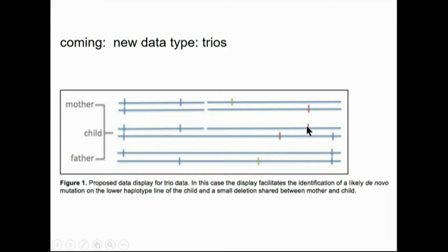But this variant came from the other chromosome. So maybe there was a rearrangement between them in the egg. Whereas this other chromosome came from the father, but that variant there is de novo. It didn't come from either parent, even though it's in the child. So if you have phased data, you'll be able to see the mother and the father and the de novo.